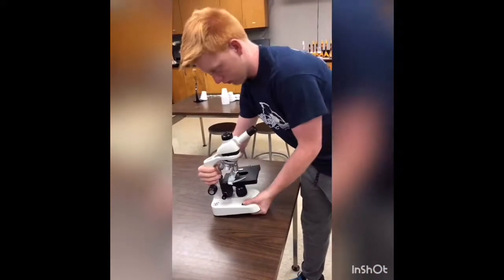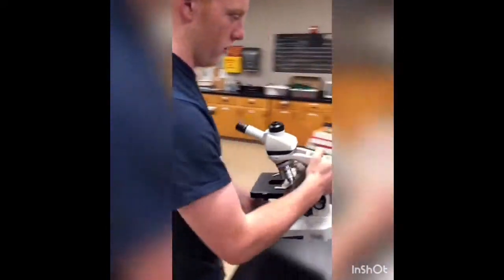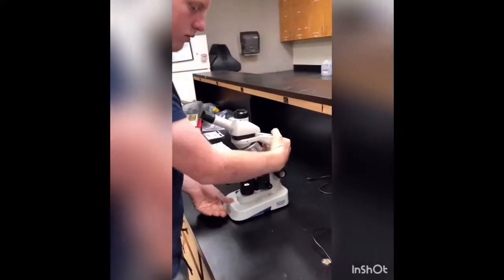To pick it up, you want to put one hand on the arm, which is this, and another hand on the base to carry it. Make sure you walk steady, don't trip over anything. You put it on the table.